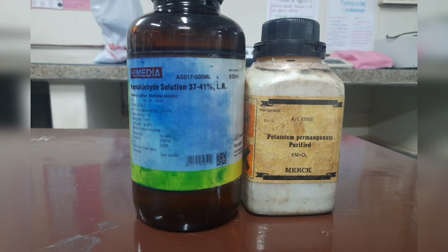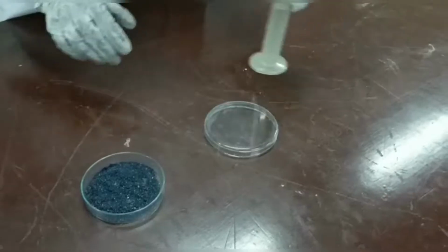First one, fumigation. Fumigation is a process of gaseous sterilization which is used for killing microorganisms and preventing microbial growth in air, surface of wall or floor.